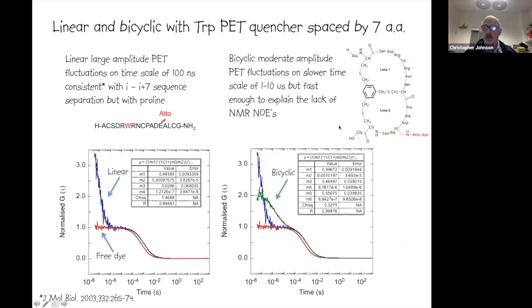And this was done in the early days before this technology was commercialized into the company Bicycle Therapeutics. But these bicyclic peptides have this thiol chemistry, which leads to this sort of figure of eight conformation. And they had evolved this particular sequence, where you can see it here in a linear form, which is an inhibitor of kallikrein. And what they were interested in was having a look by NMR about whether or not the bicyclic peptide had additional structure.